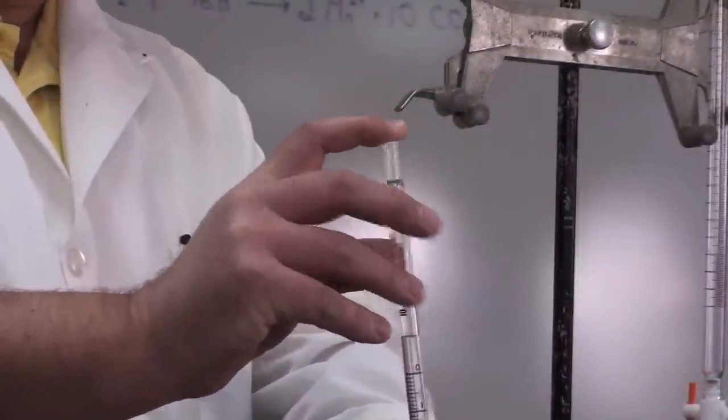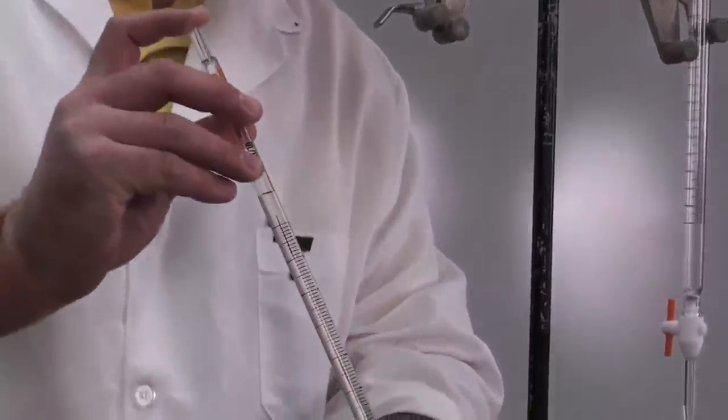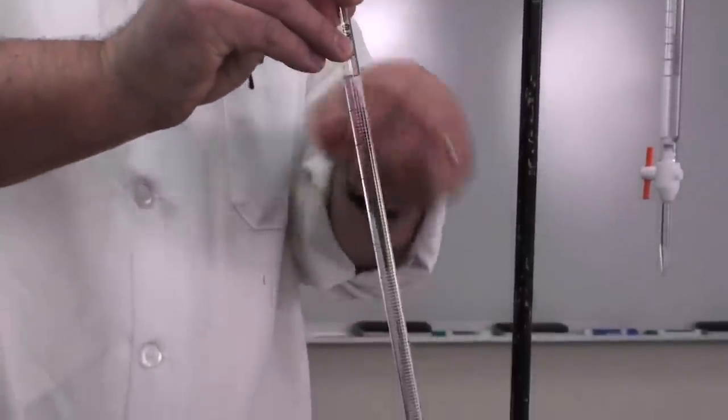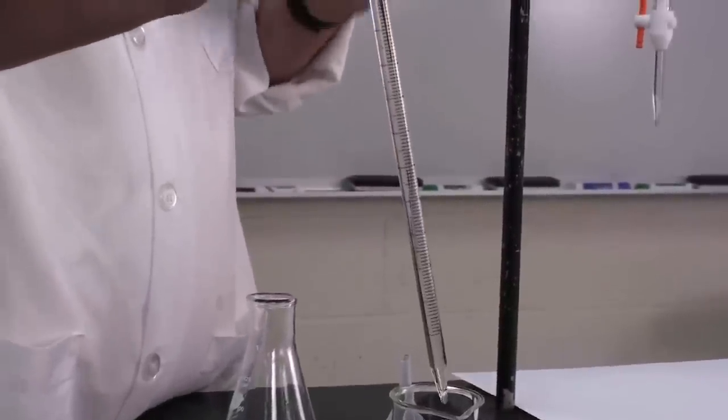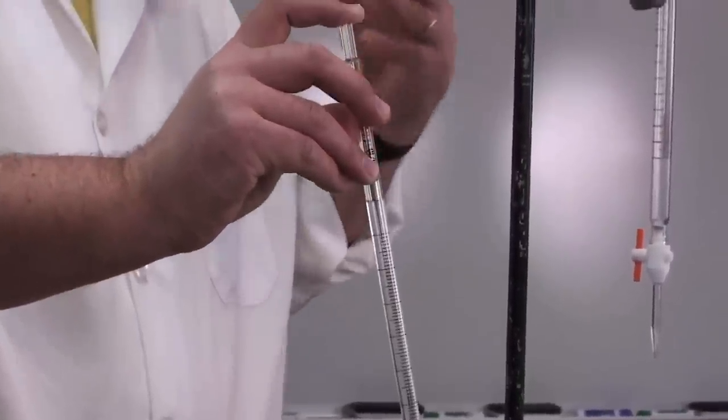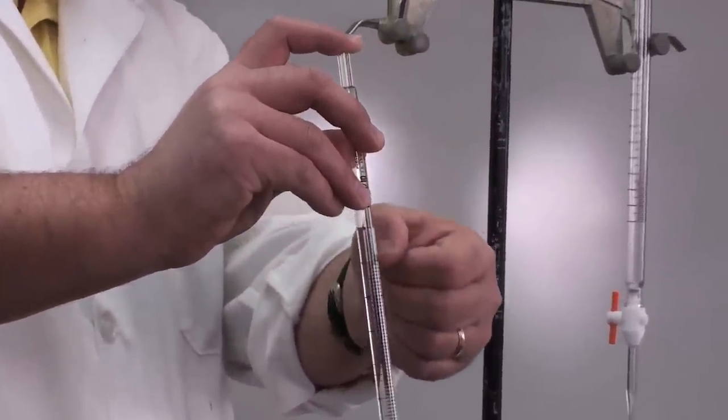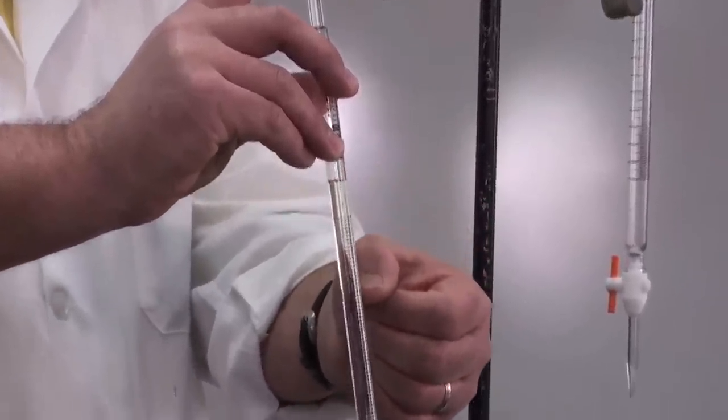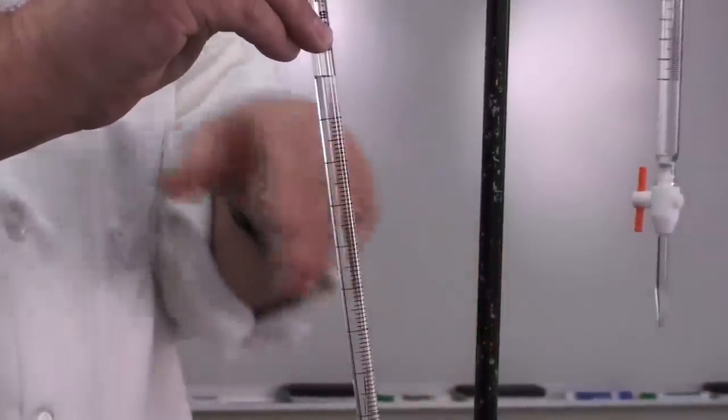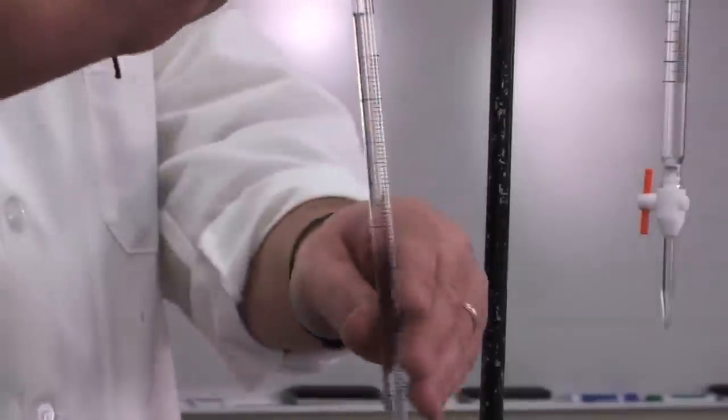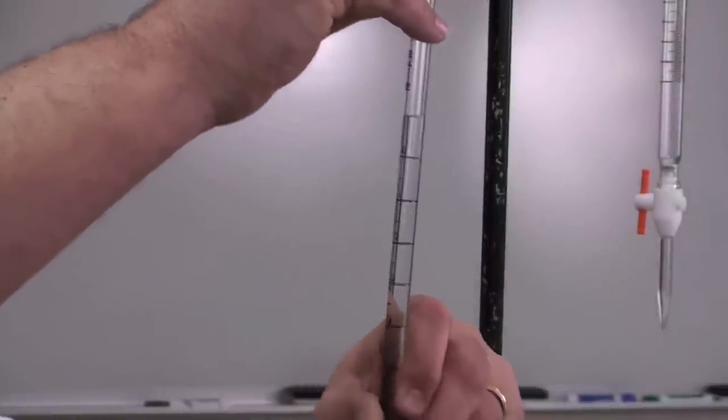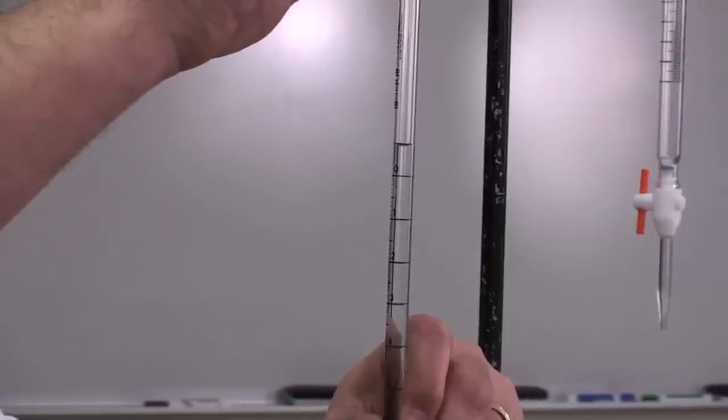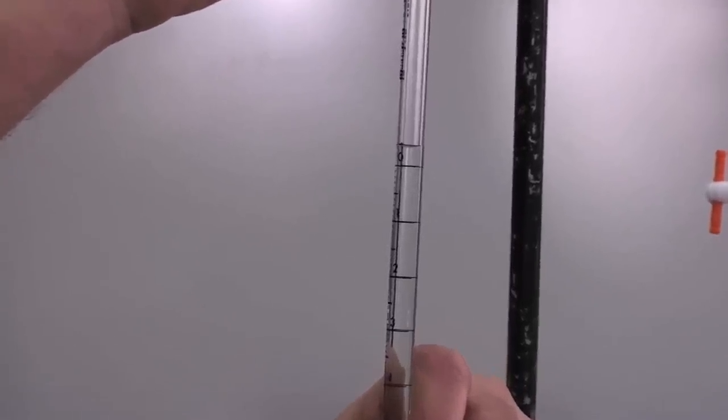You squeeze the bulb, stick the pipette into the solution, then draw the solution up. We're going to pipette 10 milliliters, so I want to take it all the way to the top, a little above. Then I take the bulb off and use my finger to stop the flow of the reagent. Notice the graduations run from 0 to 10 in 1 milliliter increments, with smaller marks every one-tenth of a milliliter.